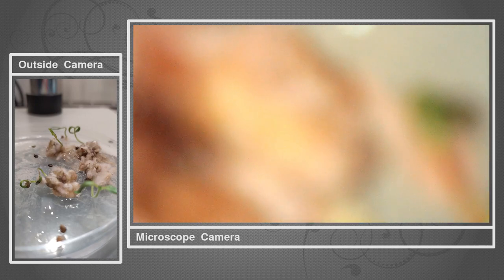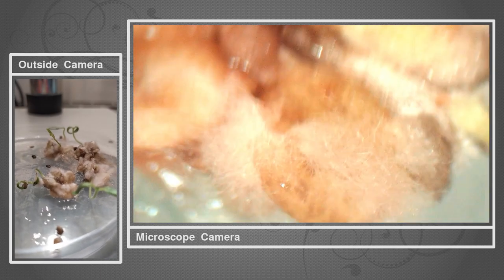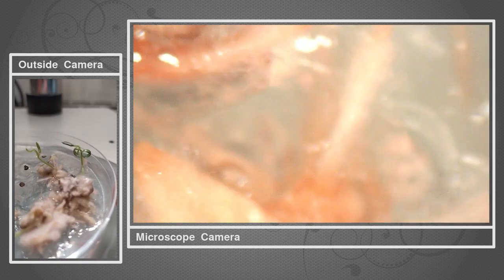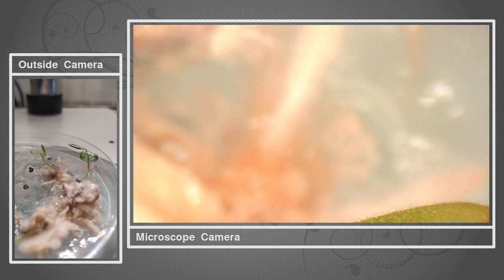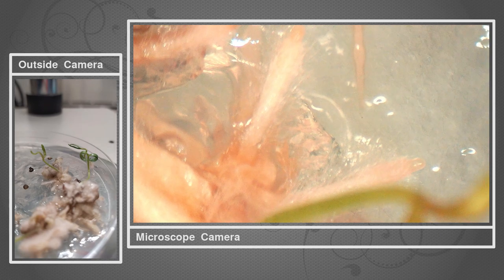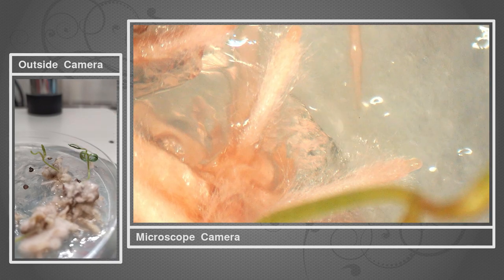Let's take a closer look at this — if you can zoom in a little bit. Let me move this around and show you a different part — maybe I'll show you some roots right there. Let's try to focus on that. Again, we have our roots. Lots of little hairs, which is very common. Root hairs allow the plants to extract as much nutrition as possible from their surroundings.